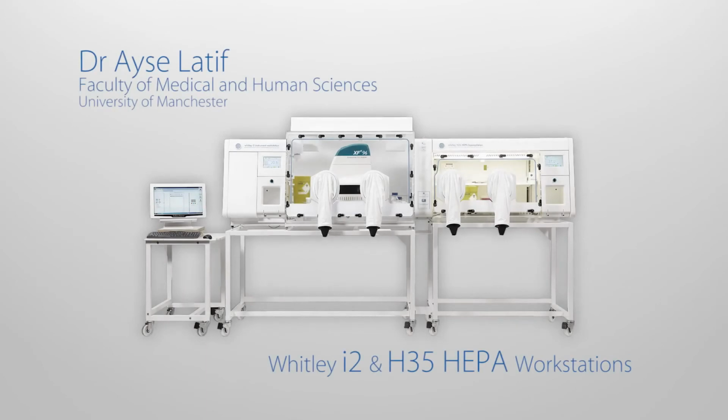For our research interest over in School of Pharmacy, we use H35 and I2 hypoxia workstation. Our research interest in our group includes exploiting the tumour cell energy metabolism in order to improve gynecological cancers treatment. Gynecological cancers in nature are hypoxic solid tumours. That's why we are interested in performing our experiments under hypoxia at different oxygen tensions, whereby we can actually mimic the environmental conditions that we will see in actual tumours.